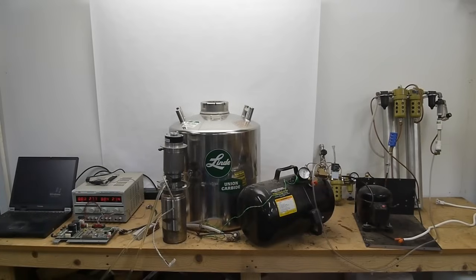Then the black tank is a nitrogen gas storage tank, a black compressor pulled out of an air conditioner next to that, and then an air dryer and nitrogen separator device.